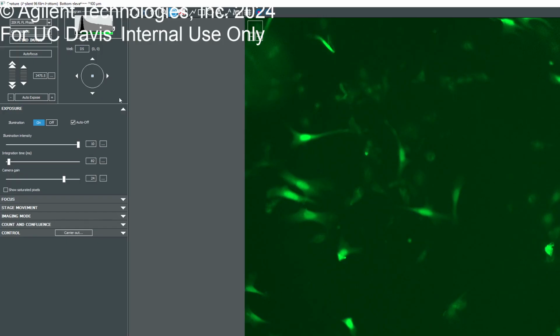And then I don't know if we moved or not. But I guess going back to the initial question, is there a way to do autofocus? No. Okay. In the experiment mode, no. In the manual mode, yeah. Through each channel, do we have to auto expose and autofocus every time? Yeah, so for the first time, yes, you would have to, and then it will be set. Once you set up the exposure, you don't really need to change that afterwards for each of the channels.